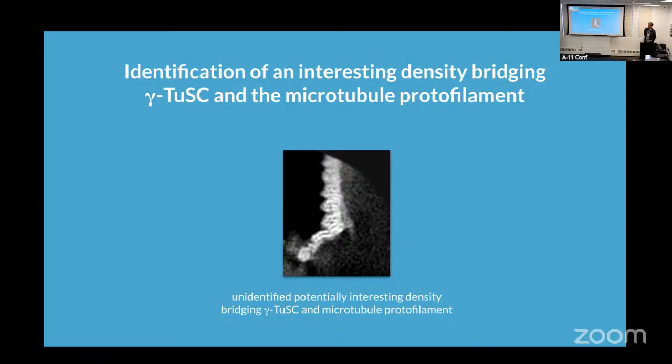An isosurface is very useful, but if you have different regions of your volume at different intensities, because you have, say, lower occupancy or some flexibility, then cutting at the same density level is not necessarily giving you a great representation. So isosurfaces are only really good if you are also changing the threshold and spinning them around. But if you look at slices through the maps, you often see features and things become obvious about what might be going on.